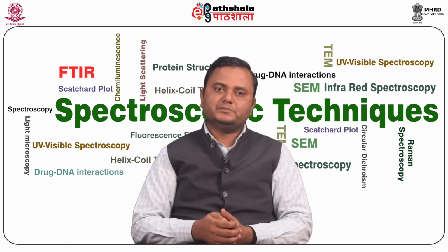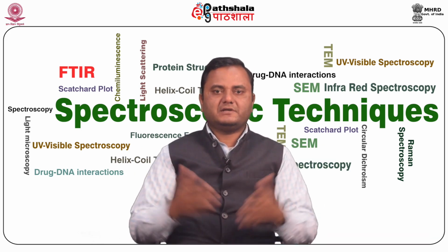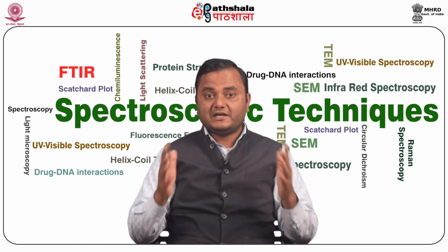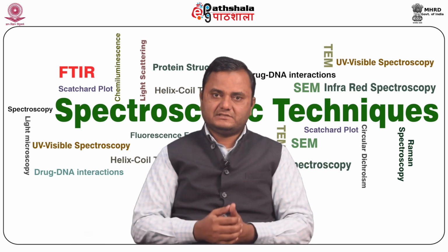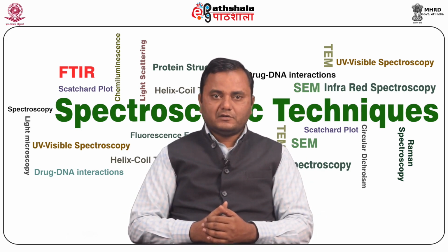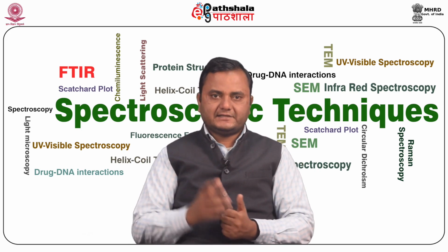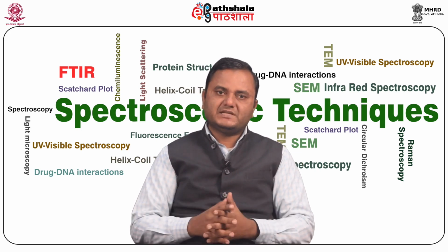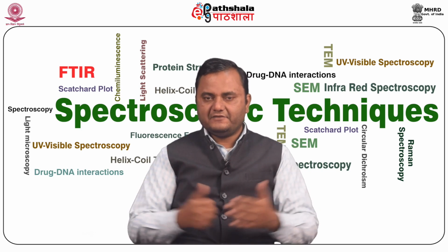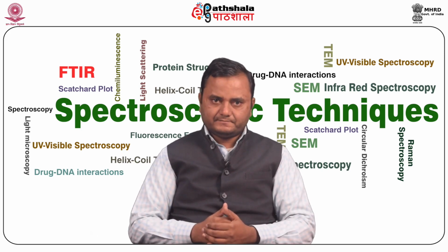And based on that functional group, you will be easily able to identify the chemical properties and the actual chemical compounds or trace material as well. Infrared spectroscopy can be used as a fingerprint for the identification of unknown compounds. It also gives information about the structural features of a molecule or the functional group attached to a molecule, which produces a characteristic and reproducible absorption spectrum in the IR region that can be used to identify different types of molecules and their structural and functional properties.